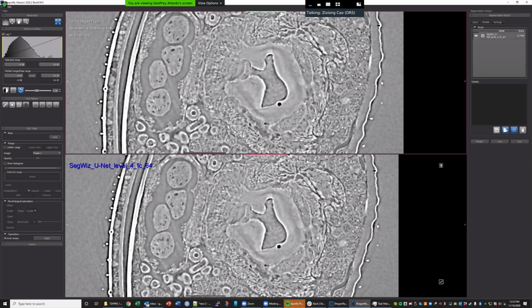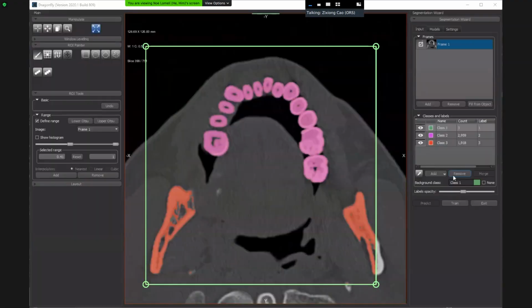Before we finish, do you have any further questions? Yeah, I do have a question. I did another example. How do I put the class as a background when you paint all in green? Can you remind me that, please? You drag. You already put this as a background. Yeah, but I don't see it in green. How do I do that? You mean this one? You right click.